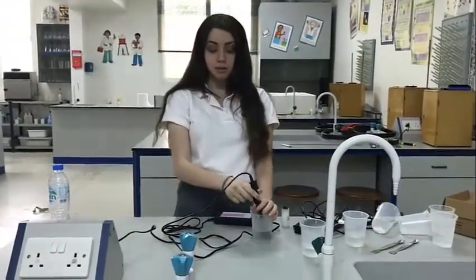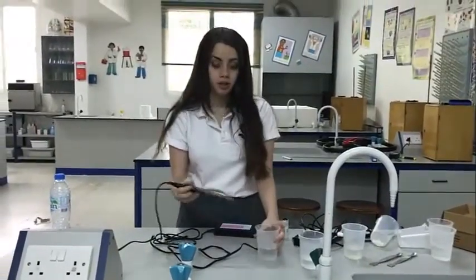Okay, so approximately it's 7, which proves that it's a neutral substance. And that was for the pH sensor.